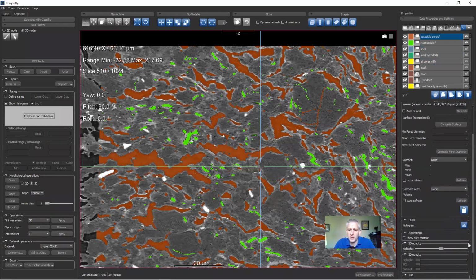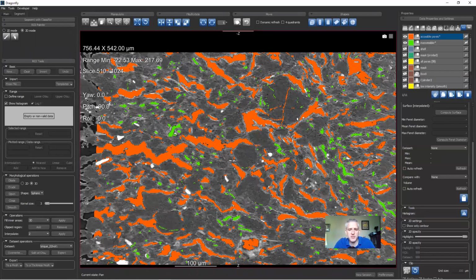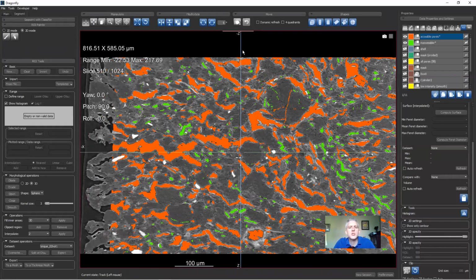I don't remember what I clicked wrong, but I clearly wasn't paying attention. Try not to process Dragonfly while explaining to 150 people at the same time what you're doing. You may make mistakes.